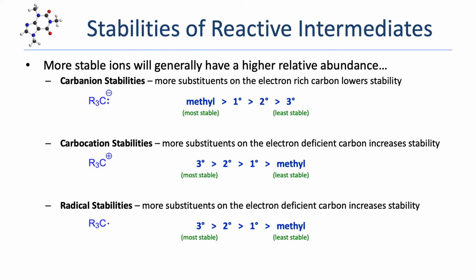Now remember, in a mass spectrometry experiment, the analyte molecules are ionized into a radical cation, again called the molecular ion. Now because the molecular ion is a radical cation, when that radical cation fragments, it fragments into radicals and cations. Now radicals are not charged, and because they're not charged, they're not going to be deflected by the magnetic field in the instrument, and that means they're never going to reach the detector. But the cations that form during fragmentation will be deflected by the magnetic field and will hit the detector.